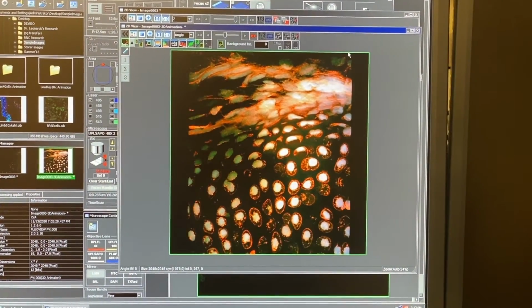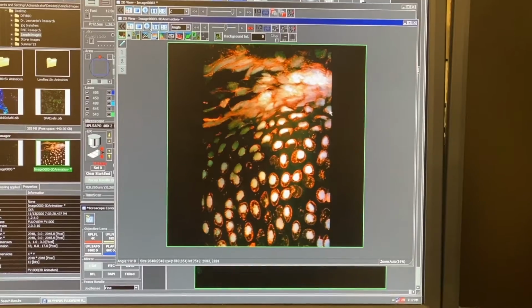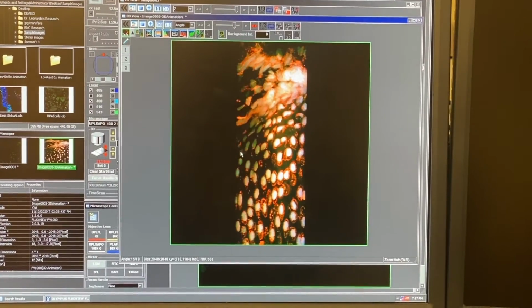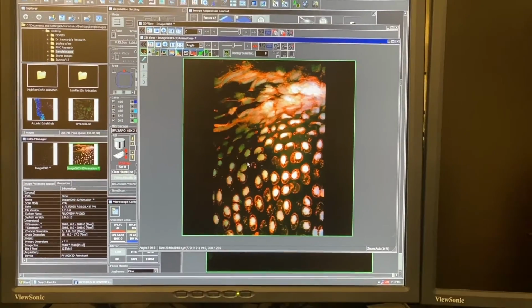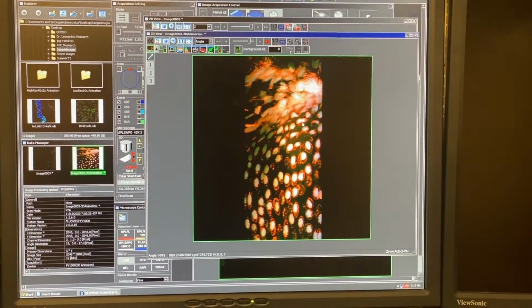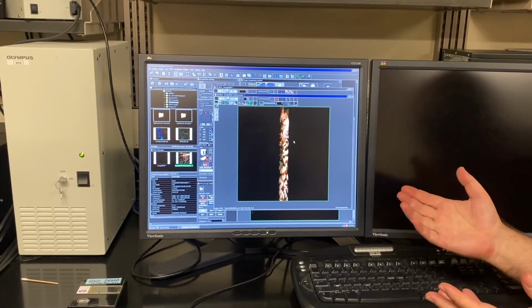Pick a cell. Is it a cell on the bottom or a cell on the top? Let's pick this blue one way over here. It's on the bottom cell layer. Let's pick this green one. Follow that cell. It's on the top layer. So here we've made 3-dimensional with only 9 pictures, right? That's only 1 micron per picture. It's not like the pollen grain where we took 135 pictures. That is completely possible, but our tissue is not that thick, right?